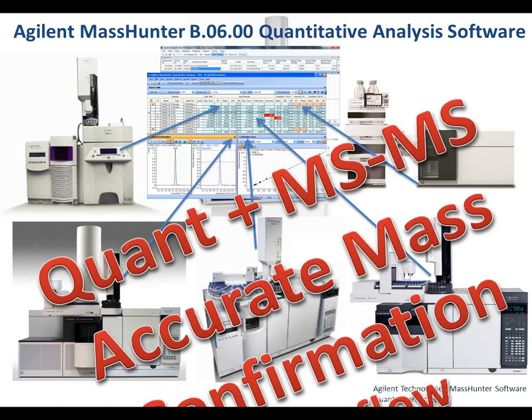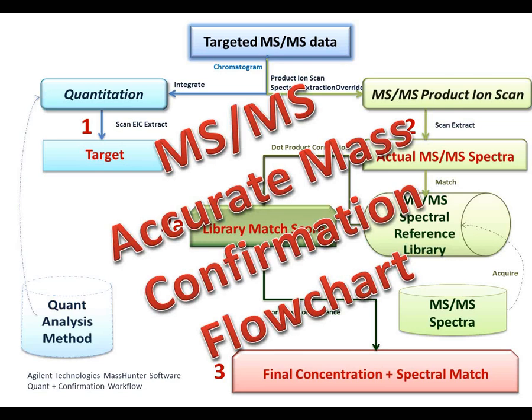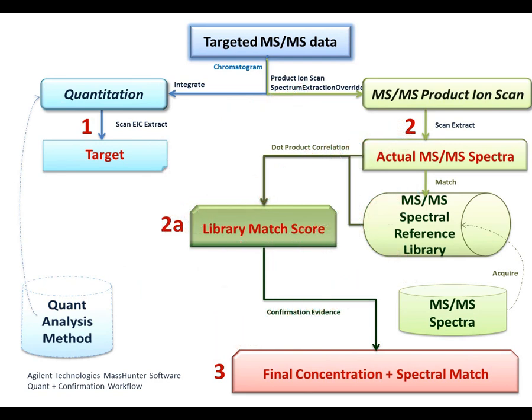I'm delighted to welcome you to a new workflow, the Quant MSMS Accurate Mass Confirmation workflow. So let's walk through this targeted MSMS workflow. And I'll start, of course, with the quantitation.